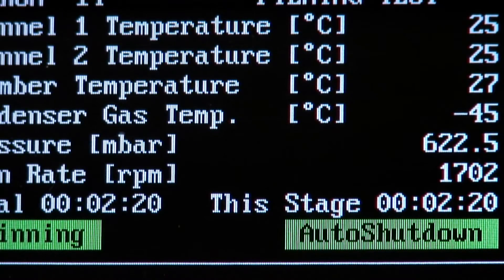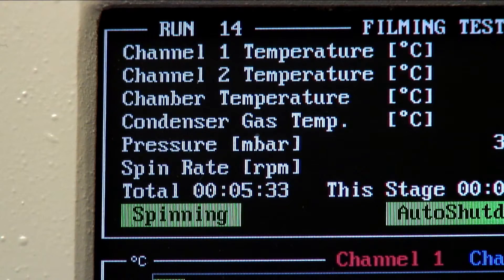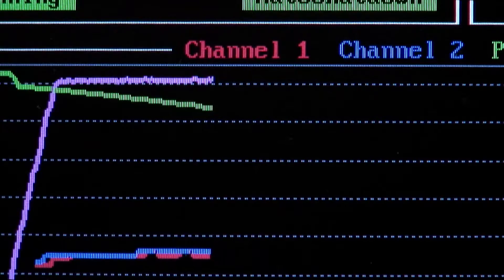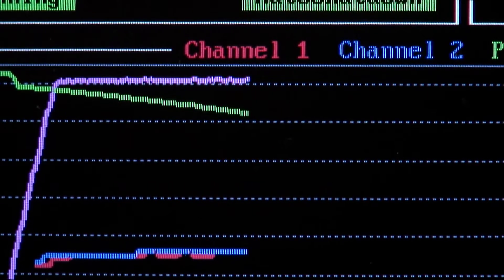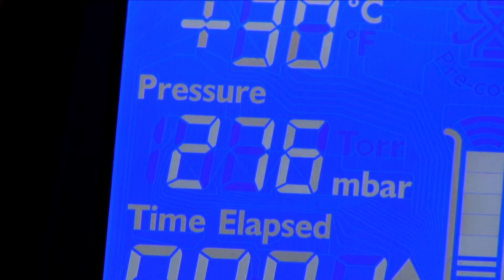At the same time, the pressure is slowly reduced so as to carefully control the boiling process. All Genovac evaporators are equipped with technology to directly monitor and control the temperature of the samples inside the system, ensuring samples are not exposed to harmful temperatures.